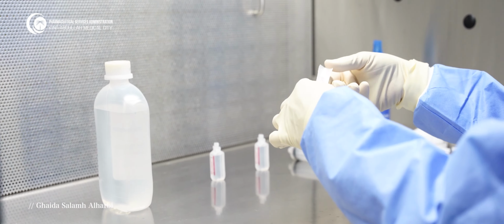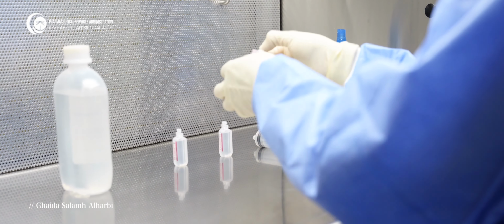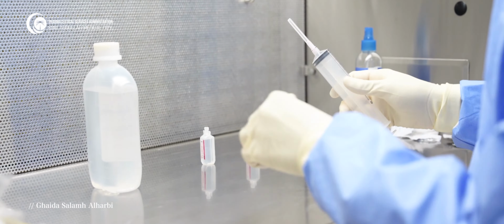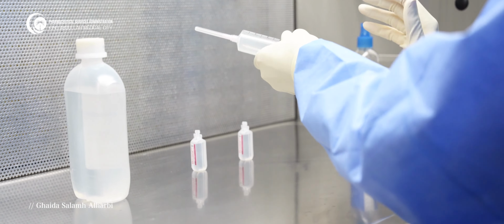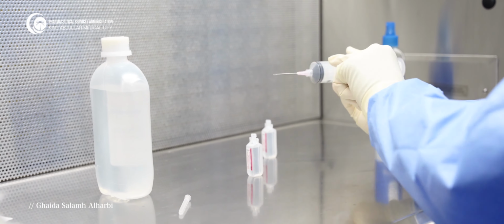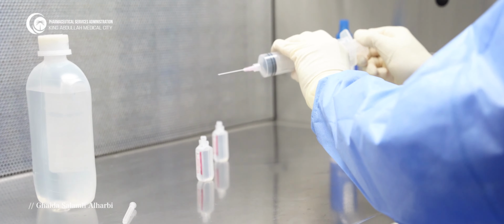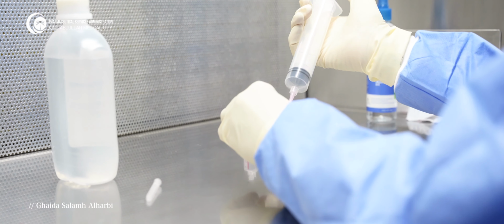Of course, all items before being introduced inside the hood are already wiped with alcohol. We will transfer the needed volume using needle and syringe. Take care while you open the needle, don't touch any part of the needle, as all parts of the needle are critical parts.